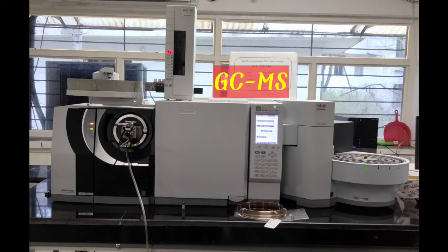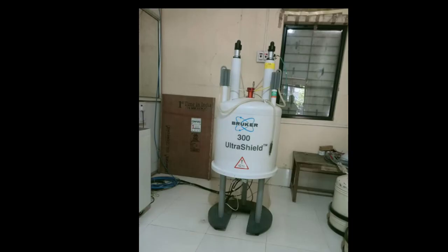The mass spectroscopy detector is added to the gas chromatography. The MS, meaning mass spectroscopy, provides a mass spectrum which will be useful for the characterization of a compound. The GCMS is used for the analysis of an unknown organic compound mixture.